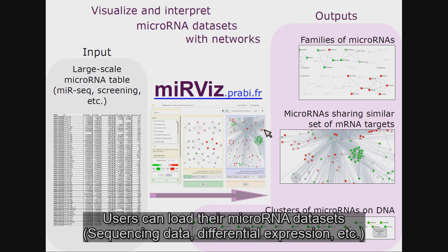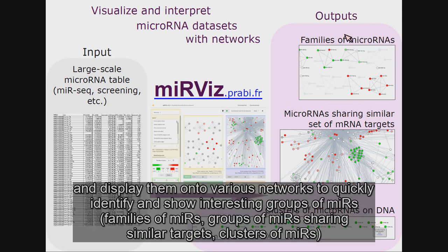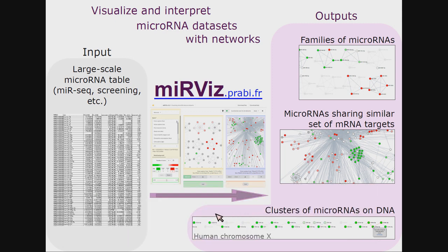Users can load their microRNA datasets, such as sequencing data, and display them onto various networks to quickly identify and show interesting groups of miRs, such as families of microRNAs, groups of miRs sharing similar targets, and clusters of microRNAs on DNA.